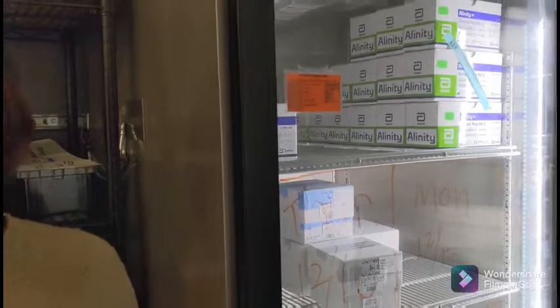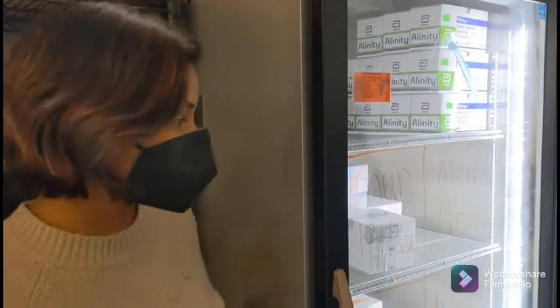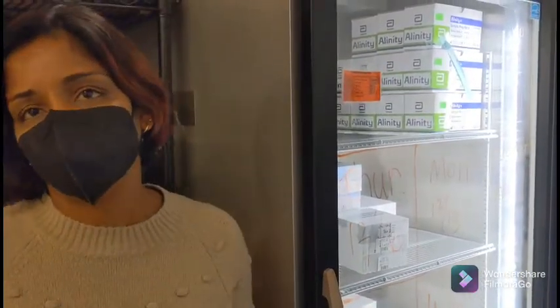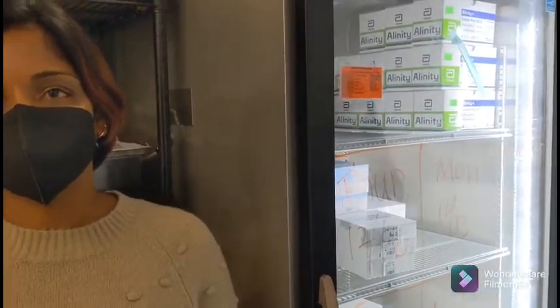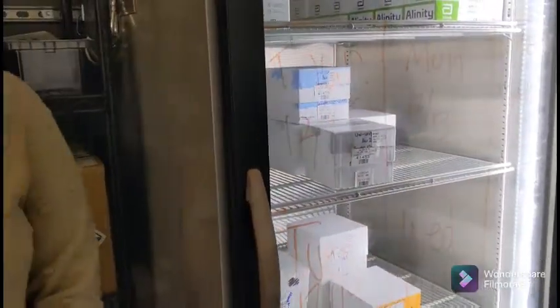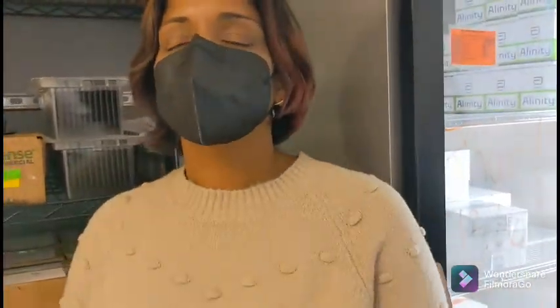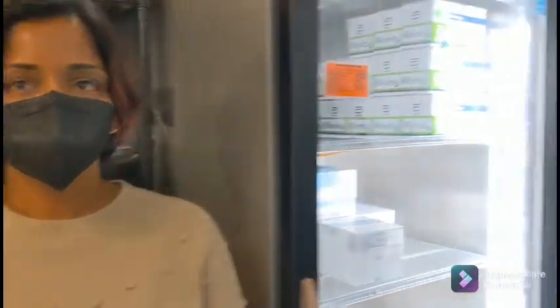We just have refrigerators and storage space for all the supplies that we need to run all of these tests, and then you'll have fridges with boxes of samples that are at different stages of processing. It's not the most exciting. No, but it has to be stored refrigerated. I didn't realize the testing supplies had to be, but some of the liquid stuff, right? Some have to be refrigerated, some have to be frozen. It varies. For somebody who might not understand, why do they need to be refrigerated or frozen? That's just how they're manufactured, and also for the samples, they're most stable at certain temperatures that you store them at.